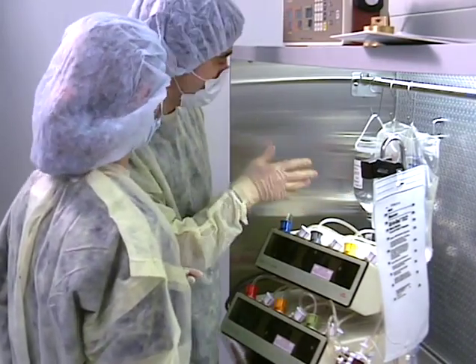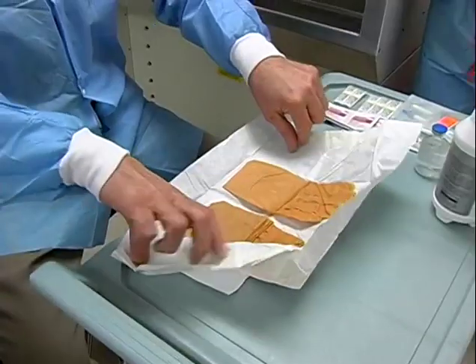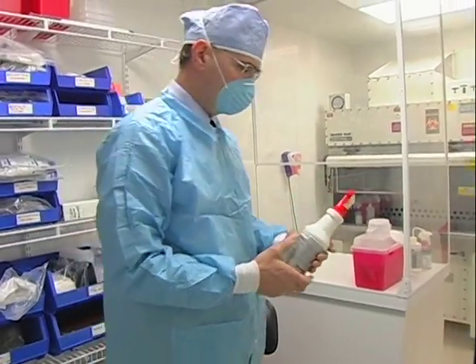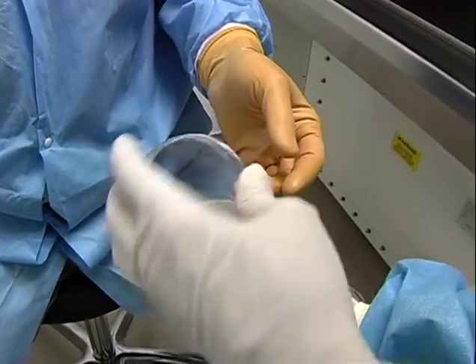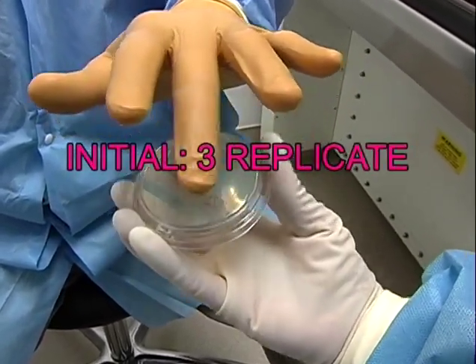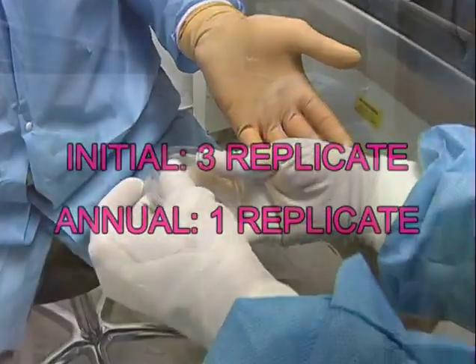The requirements for training, testing, and performance of verification procedures have been enhanced in the most recent revision of the standard. The use of sterile, powder-free gloves and sterile alcohol as a surface disinfectant are now mandated. Also required is the periodic, ongoing microbial monitoring of the operative's gloved fingertips and work surfaces. These procedures include a requirement for an initial 3-replicate demonstration of competency in the aseptic donning of sterile gloves prior to performing any compounding, and 1 replicate annually thereafter.